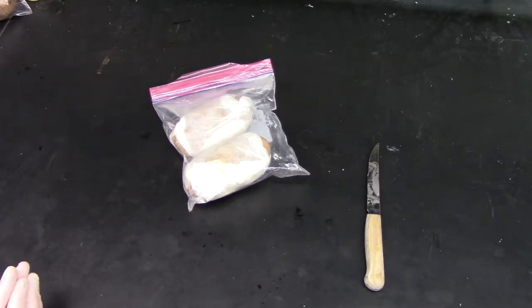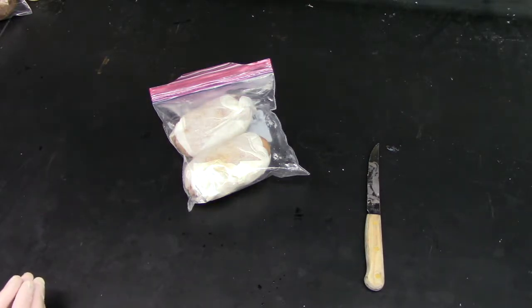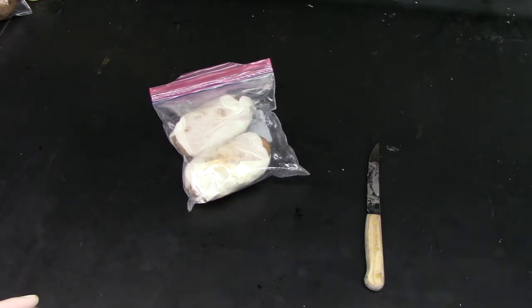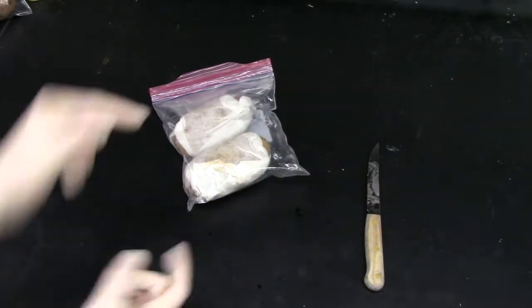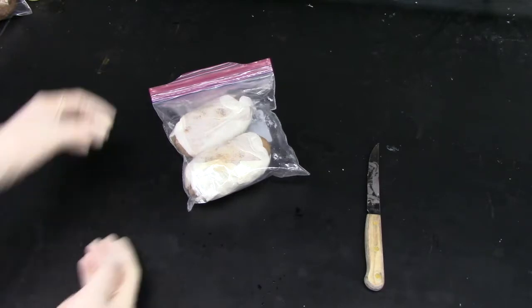So after 5 to 7 days of incubating on the bench, now it's time to observe the diseased tissue from our inoculation. In this case, I have one quart-size Ziploc bag that has 2 inoculated potatoes, and each potato has been inoculated 4 times, once on each pole and then once in the middle, equidistant apart, which will allow us the ability to have more potential areas of disease on each potato.